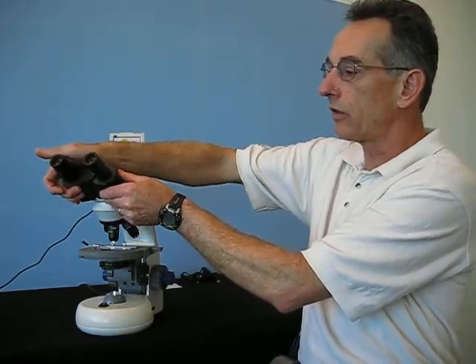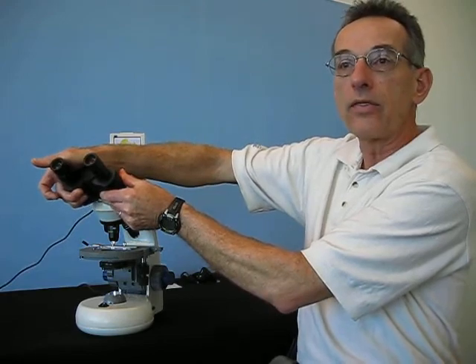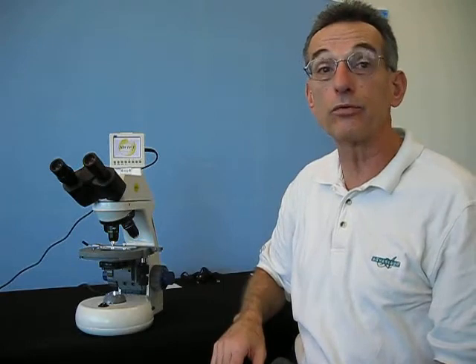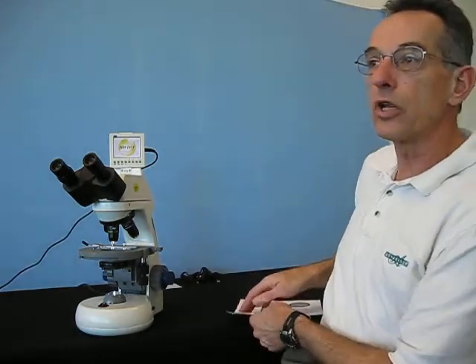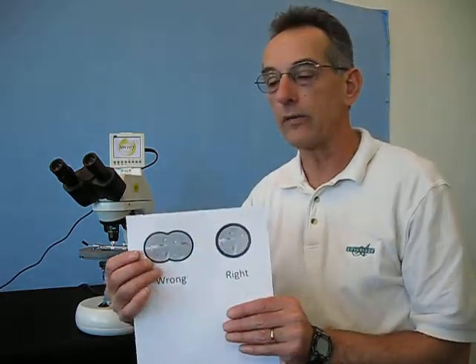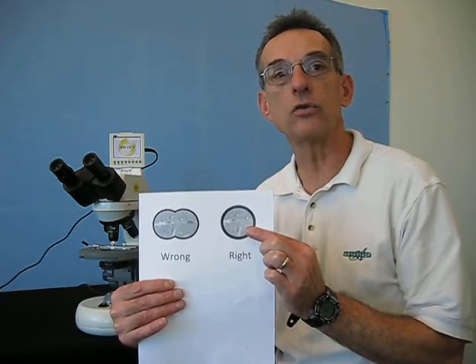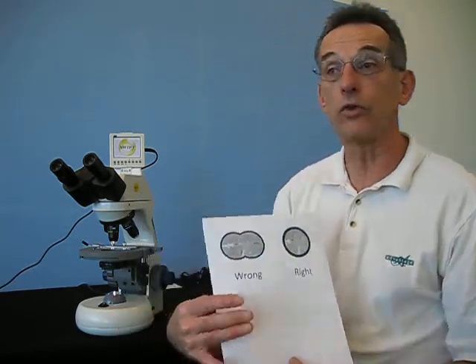First, you will notice that the eye tubes adjust in terms of the distance. That allows you to position the eye tubes so that they are very comfortable for you and, more importantly, you get a merged image between the two eye tubes and can see most clearly. If you set it up incorrectly, you won't get the best image. What you want to do is merge the images into a single common circle and that will give you your best viewing image.